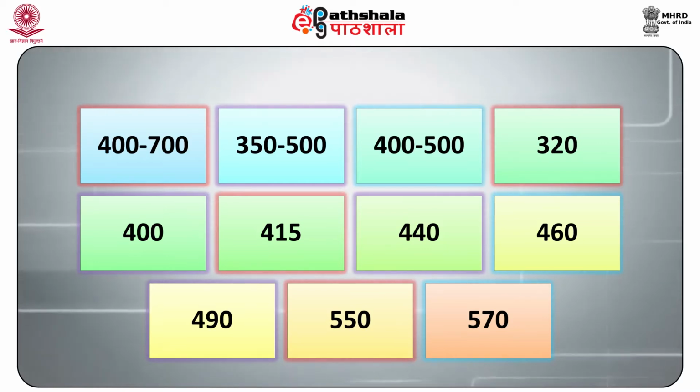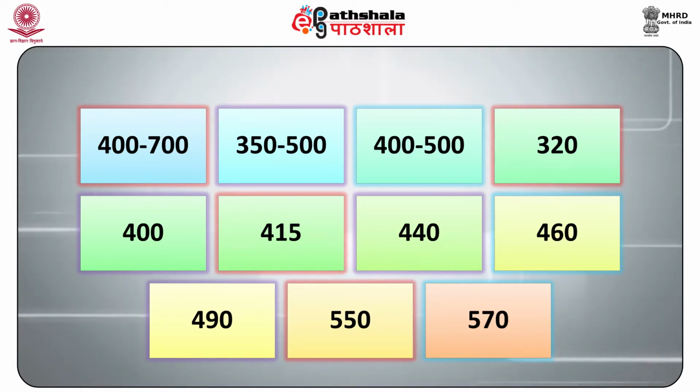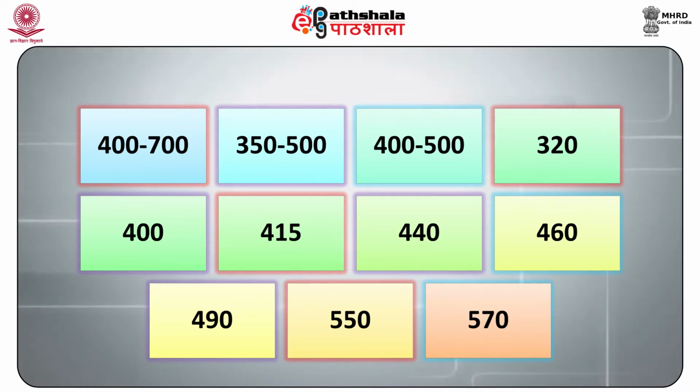In combination with the 11 excitation settings, white, that is below 400 nanometer, orange, that is below 500 nanometer, and red below 590 nanometer were used to block the excitation light and to visualize the fluorescence more precisely.